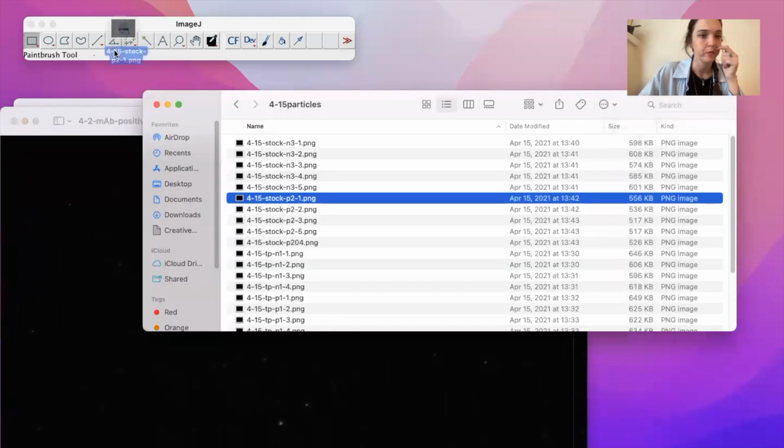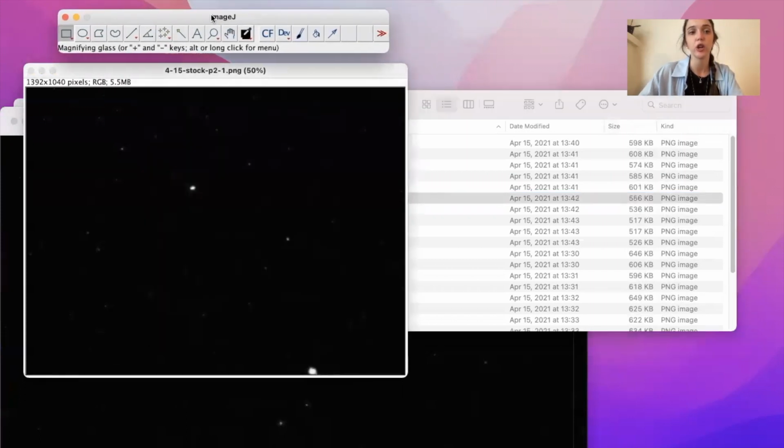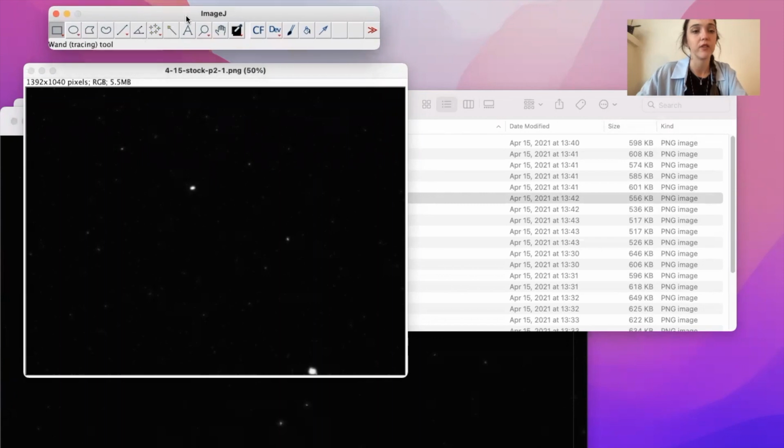Okay. So we're going to drag and drop. Okay, so ImageJ. I downloaded it previously. If you haven't got it, download. It's very easy. I can put the link down here in this video. I did used to use this on a Windows computer, and I have to say it worked a little bit better for all functions. There's a couple plugins that I haven't been able to get to work on this Mac. However, for image processing, the basic stuff, it's perfection.